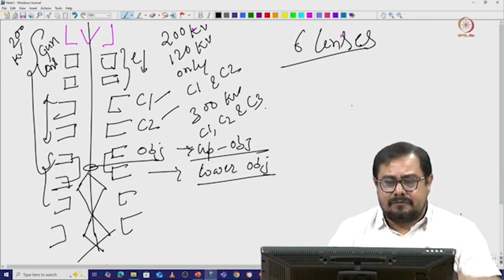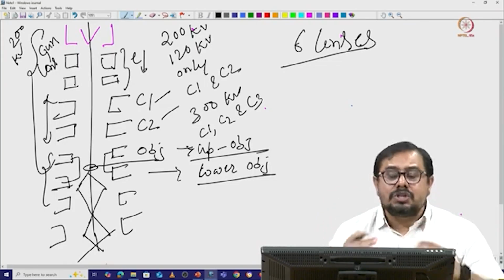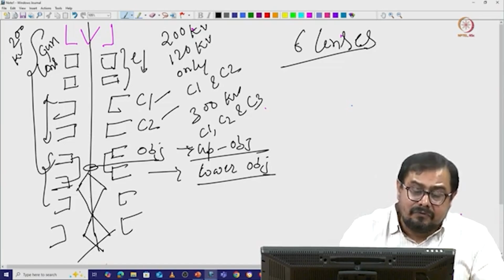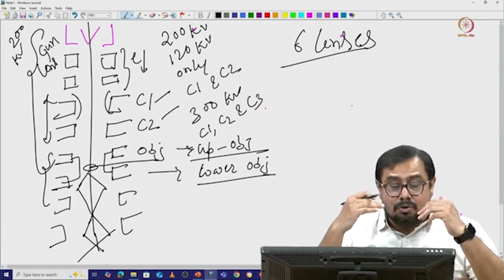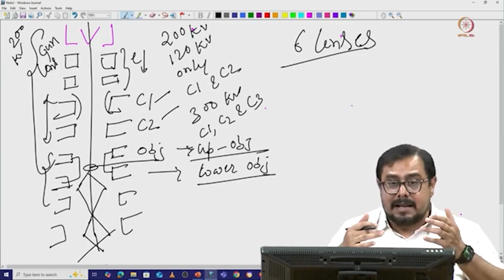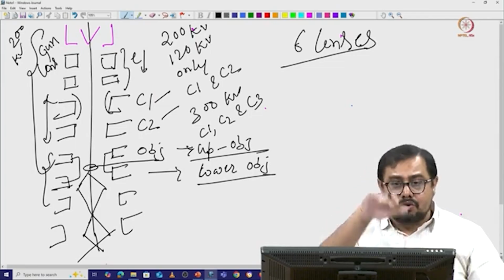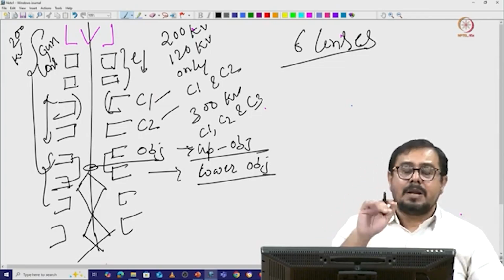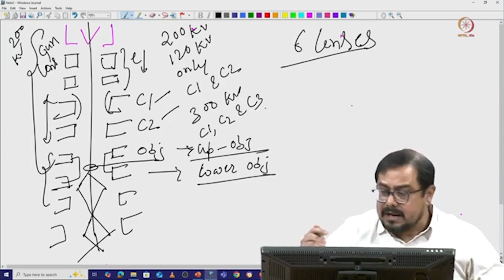Here the lenses are fixed, we cannot change the lens whenever we want. What we can change is the magnetic field or electric field of that lens. Those lenses are called electromagnetic lenses. If we change the magnetic field, we can change the crossover point of the sample, so that focus point, we can change it.